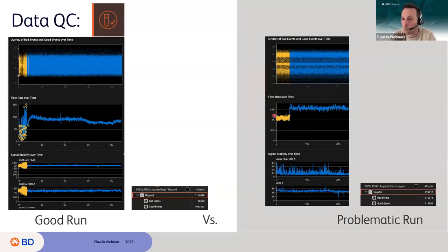The user, if they were using, I don't know, a Symphony or something like that, they put it from low to medium, or medium to high, or if they're using maybe a Canto, they just change the speed directly in the software, or they just increase the number on the queries from 1 to 10, etc. for the speed.